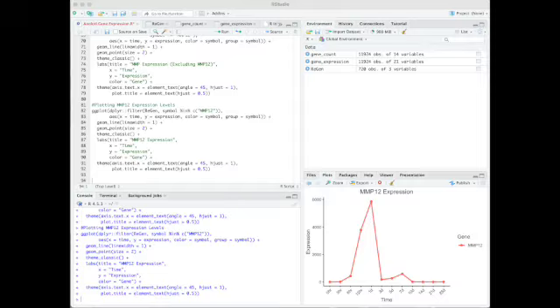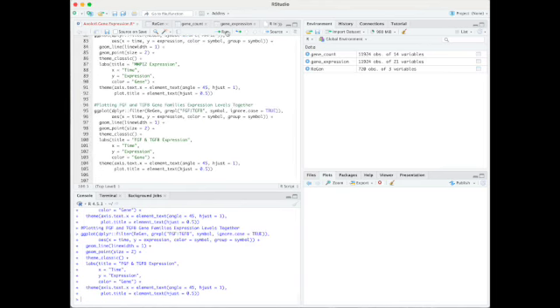We will now be plotting two gene families together, FGF and TGFB, because they are both growth factors, so it will be best to compare them together. We will still be using ggplot, and we will also be using dplyr filter to filter in the Regen data frame, searching for the genes with grepl to find the genes FGF and TGF in their name. This will filter the data and only include the genes when plotted with ggplot.